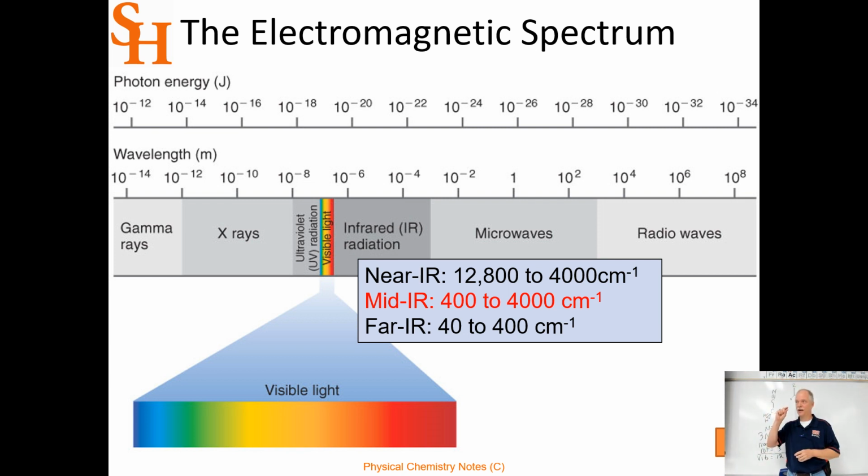So you have these little magnets. All the nuclei that have spin have little magnets. If you think about it, they're like little magnets. And if you put those in a magnetic field, they can either be with the magnetic field or against it. And so like north and south against each other, that's the low energy configuration. With each other is a high energy configuration. That energy difference is a direct function of how strong the magnetic field is.